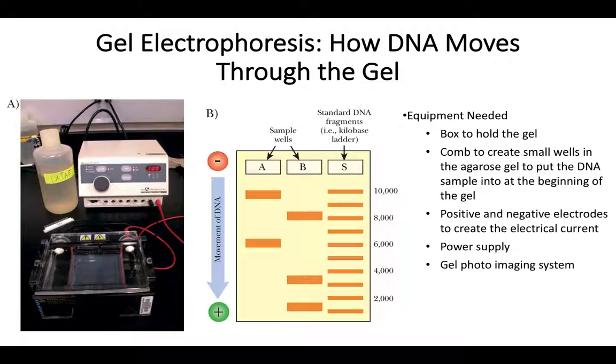Right. So as we said before, the bigger fragment, the insertions, would be higher up in the gel, and the smaller fragments, which are the deletions, would be lower down in the gel. After the gel has run for about 35 to 45 minutes, where we see the fastest running or the brightest part of the gel, which is where basically the dye is, and we're satisfied with how far it runs, we will then extract our gel again using gloves, and we will image it.